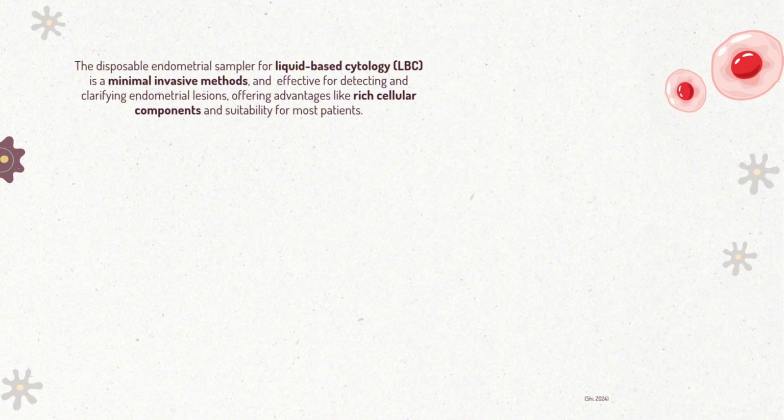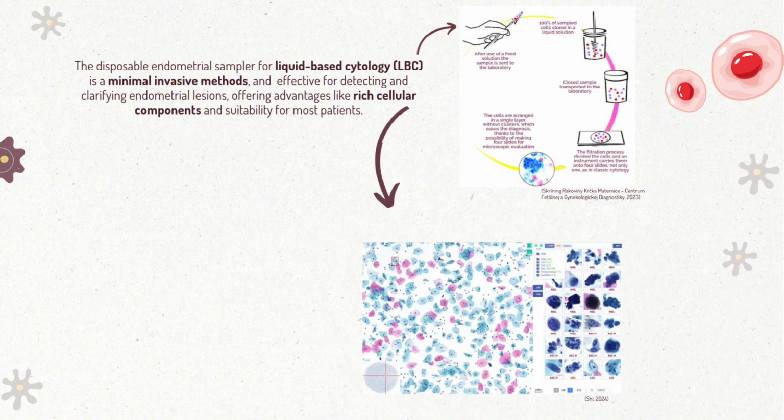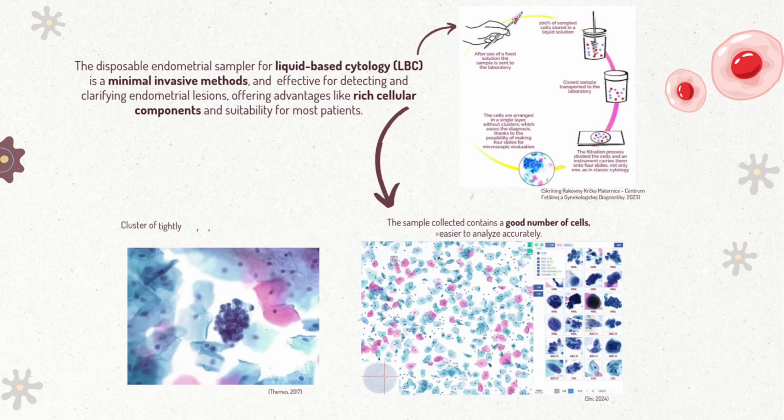All in all, liquid-based cytology or LBC is a minimally invasive method and effective to detect and classify endometrial lesions, and it offers advantages like rich cellular components, and it is suitable for most patients. For example, in the picture here, the sample collected contains a good number of cells, which makes it easier to analyze accurately. And that's all.